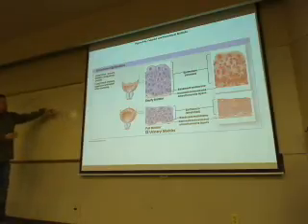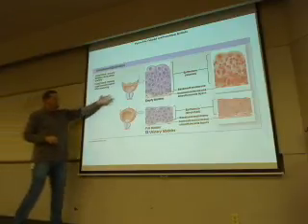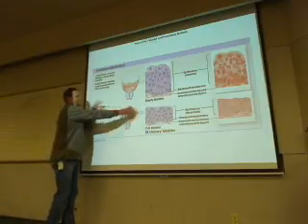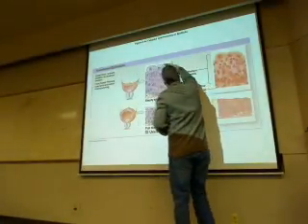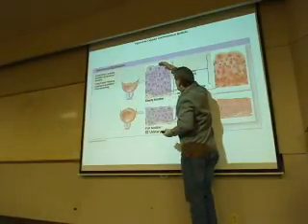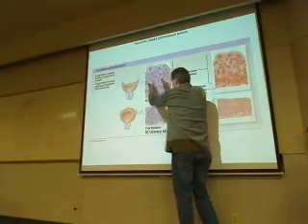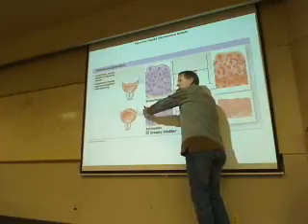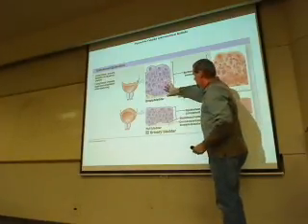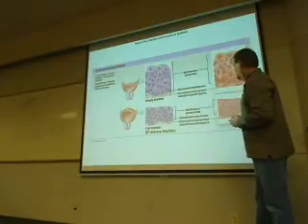So what happens is this part fills up with urine and stretches, this part fills up with urine and stretches. Obviously our urinary bladder fills up with urine and stretches. So it's called transitional epithelium because it transitions from being really tall epithelium with narrowish looking cells to really short epithelium with broader cells. In this case, we have an empty bladder and a full bladder, and they have two different appearances.